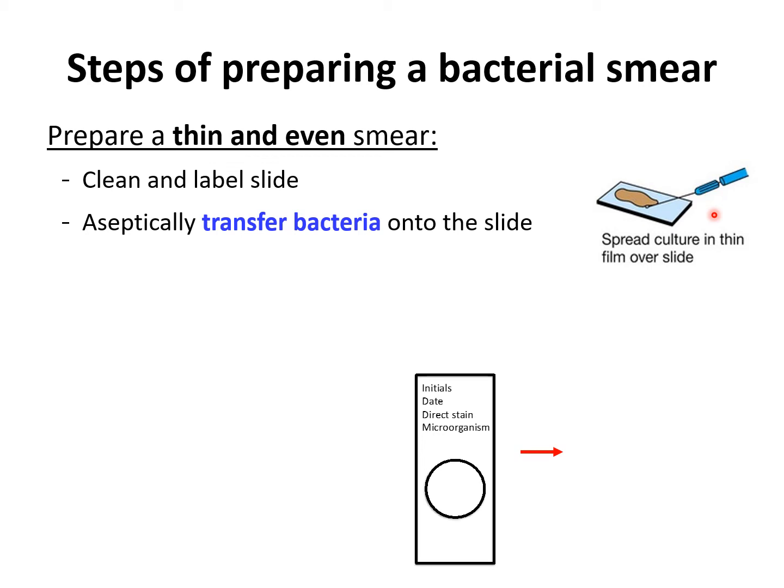So make sure that you're doing all of those aseptic techniques before you even begin, right? And then go ahead and turn on your Bunsen burner so that you can have that sterile environment. Make sure that you are working really close to that Bunsen burner. And then make sure that you also sterilize the tools that you are about to use.